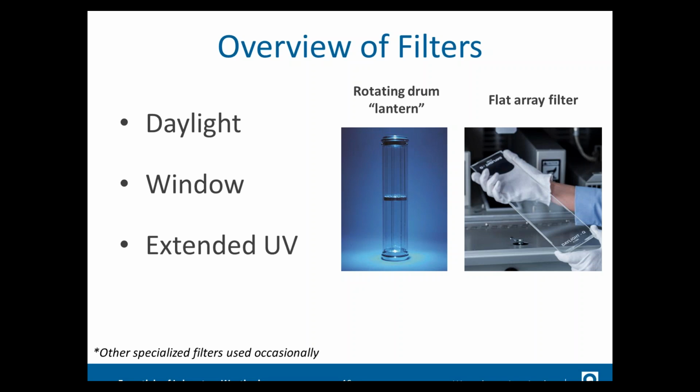And then the third one is extended UV, where we add some filtering, but it's not realistic to daylight cut-on. Again, that is something that you might use for a quality control test or a qualification, but doesn't necessarily have very good correlation.